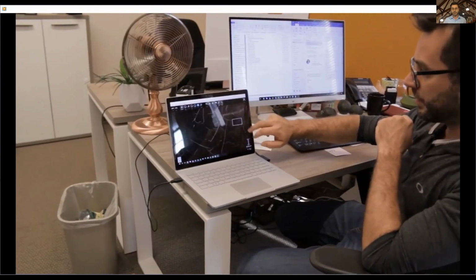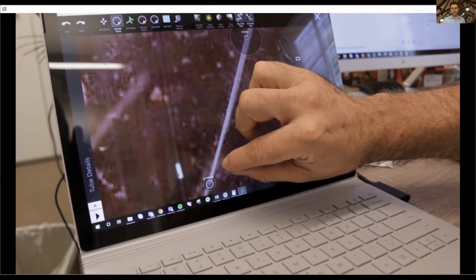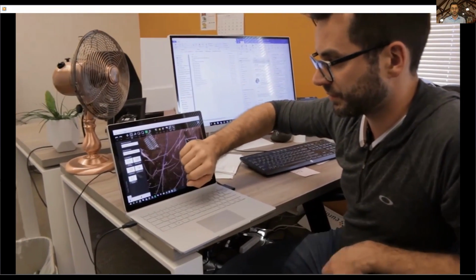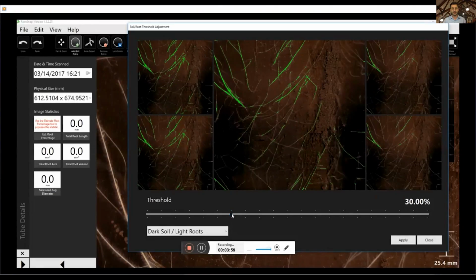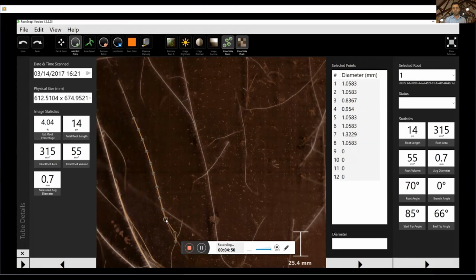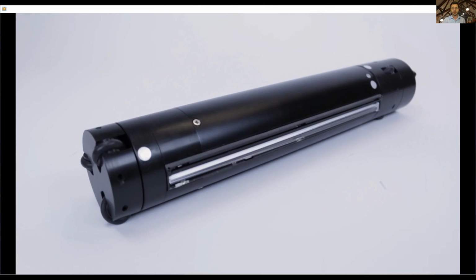The image as well, just so you can visualize better what the roots are. I prefer using the touchscreen very well because, especially when you're doing a lot of roots really fast, it is a lot faster method. It does do some thresholding, so you can get an idea of how much roots are in the bulk of it. But also, as you're mapping it out, it is doing the selected points and taking all that data with it.